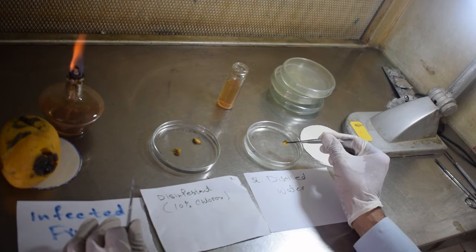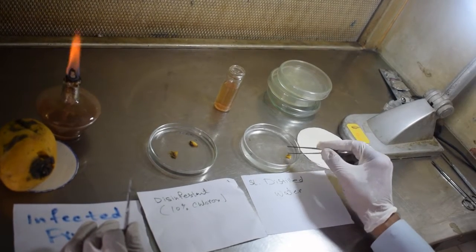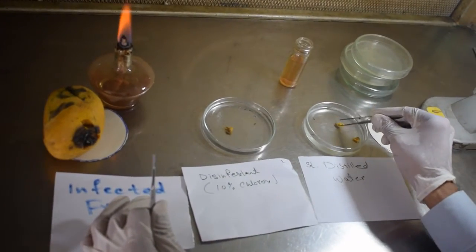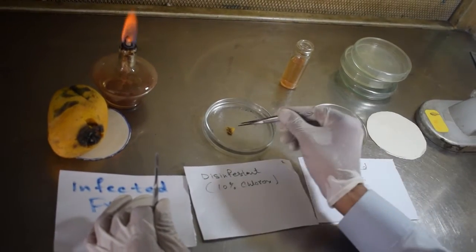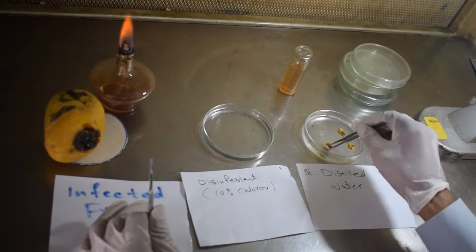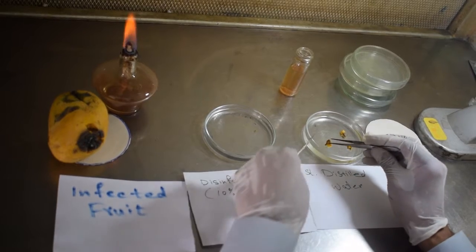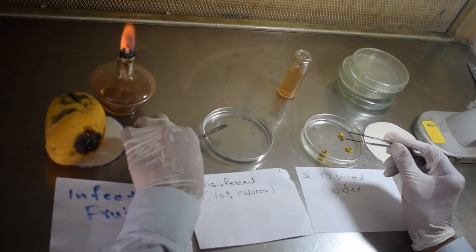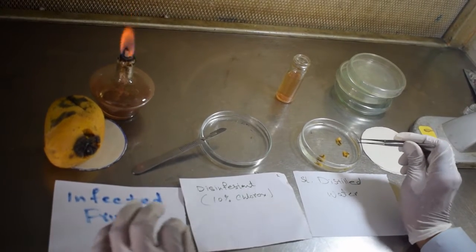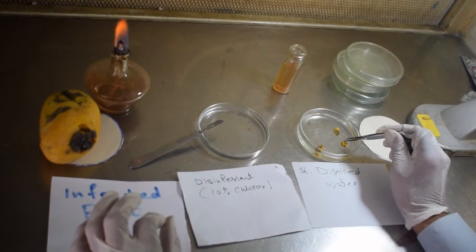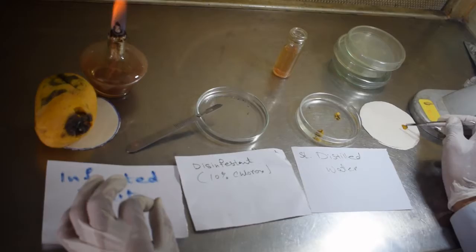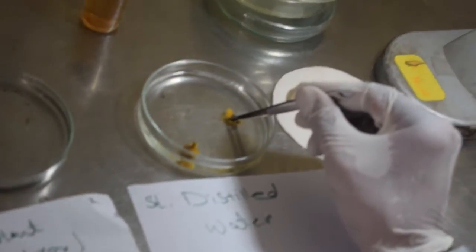Now we are placing it in the sterile distilled water for a while. These are put here just to remove the disinfectant from the surface of the infected parts, because we place them on the blotter paper before placing them in the media plates.